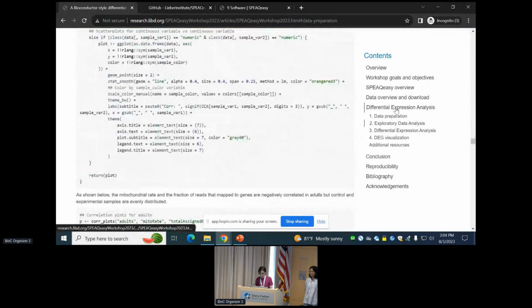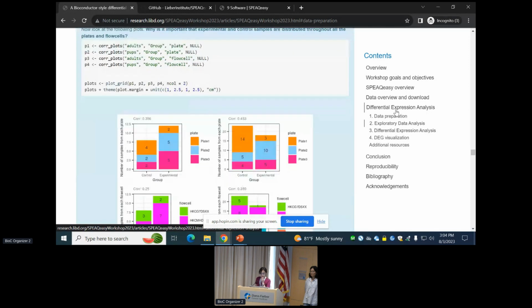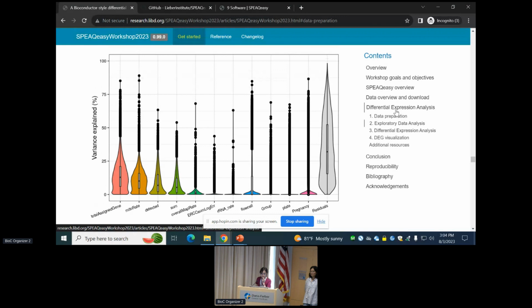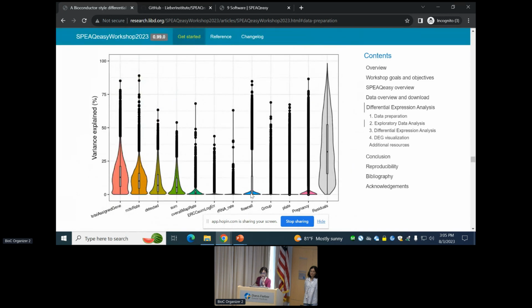These plots. But that's also why we share this data set on Experiment Hub, because the full data set is over 200 samples, which is kind of rare for bulk RNA-seq in a lot of ways. And so we think it could be useful for teaching too, because you can subset the data in different ways and do all these QC metrics.